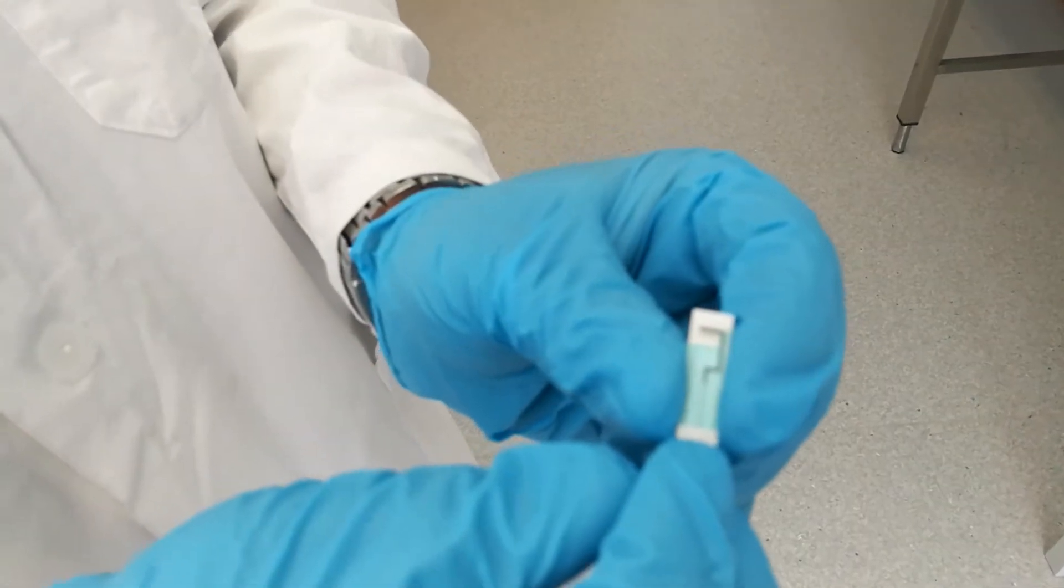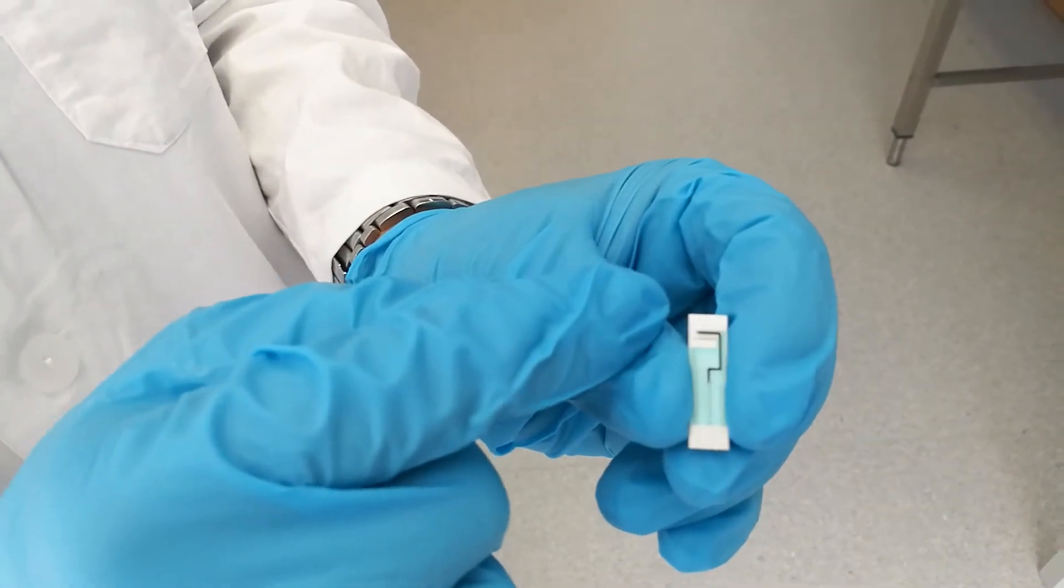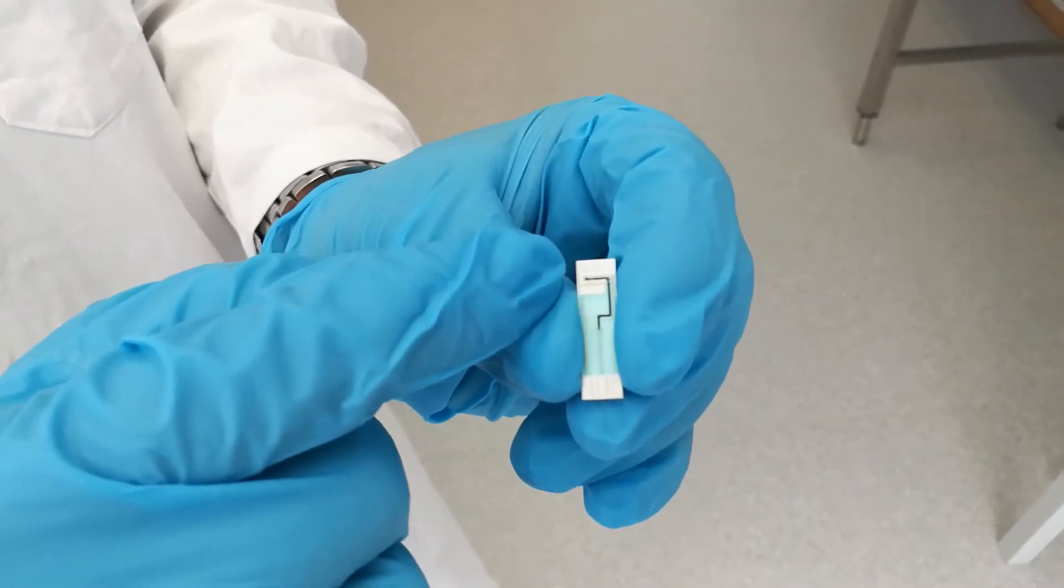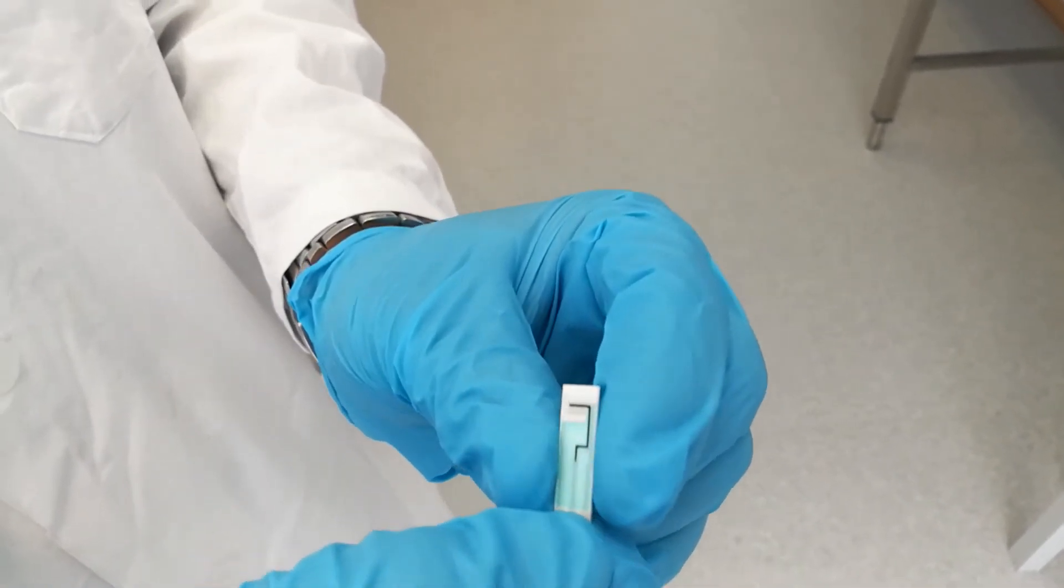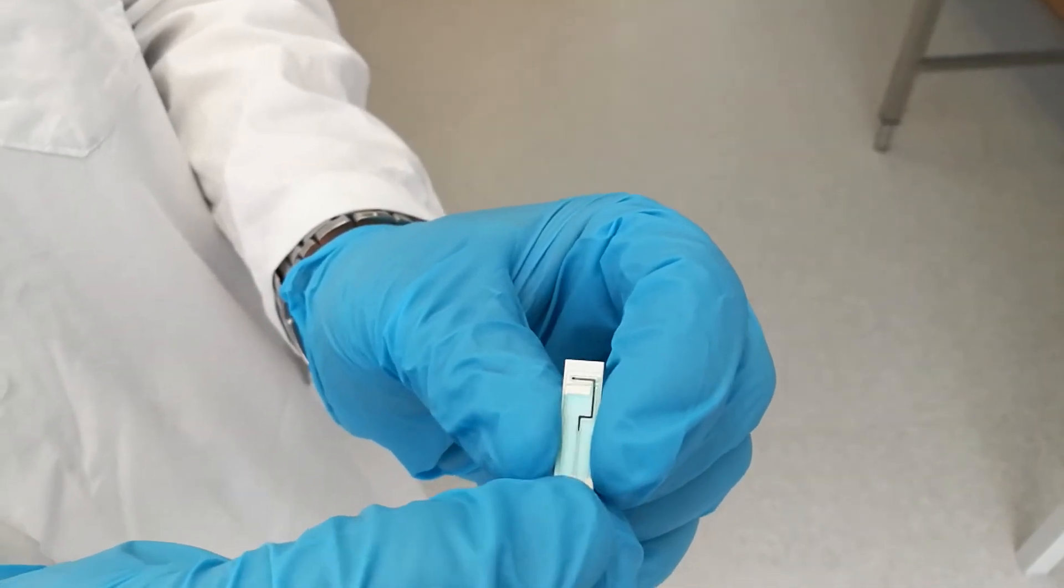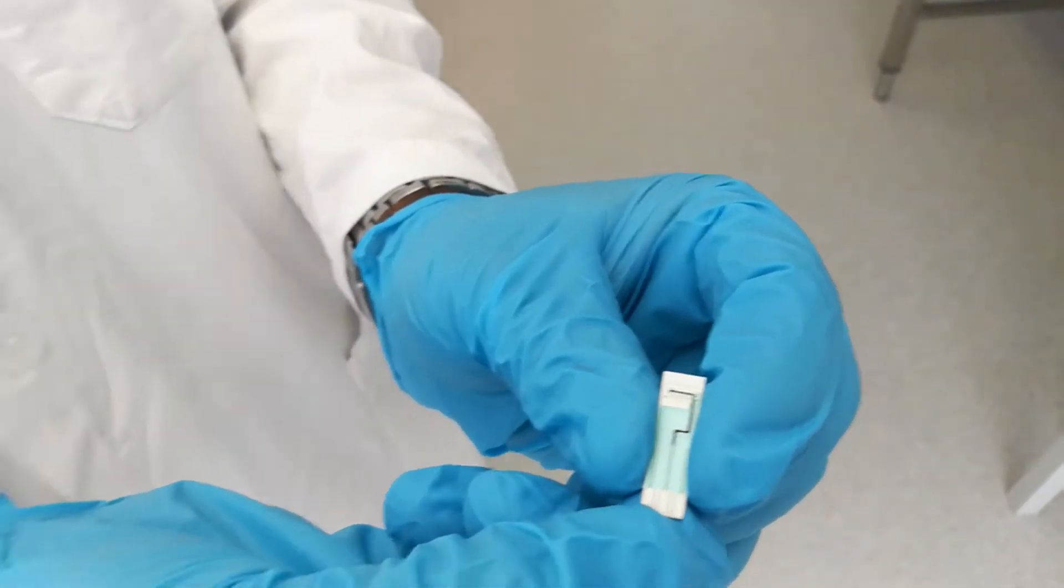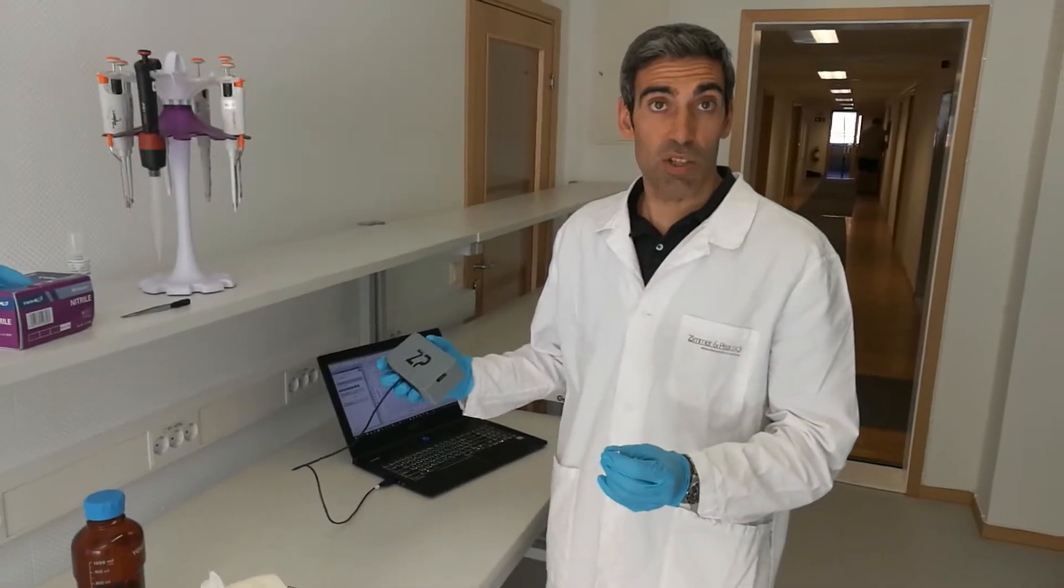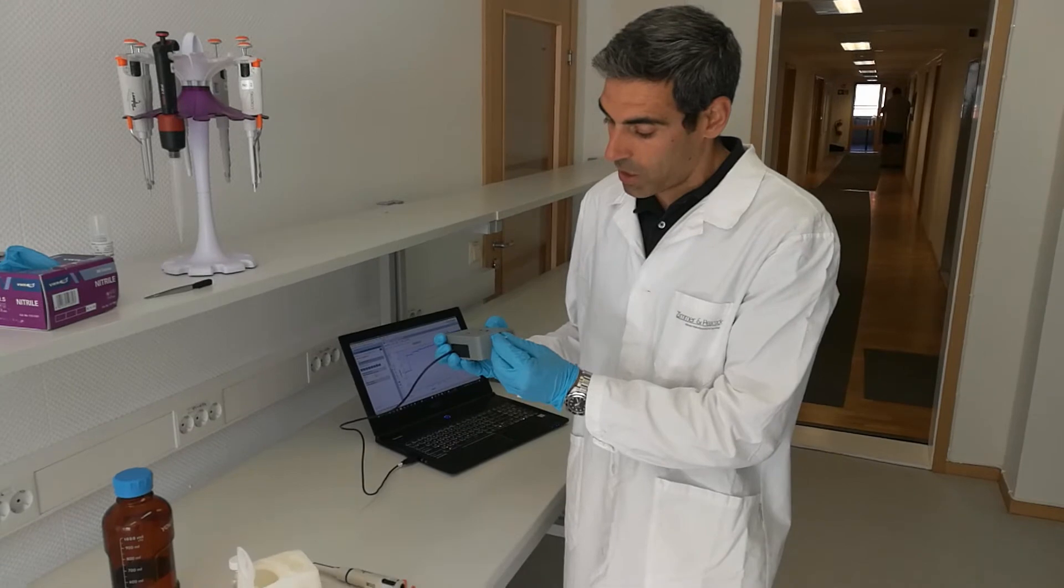This is a typical potassium sensor which has an ion-sensitive membrane on top of the working electrode, which is a dark carbon electrode, and reference and counter electrodes made of silver silver chloride. What I'm going to do first is connect this sensor to this potentiostat that's connected to the PC.